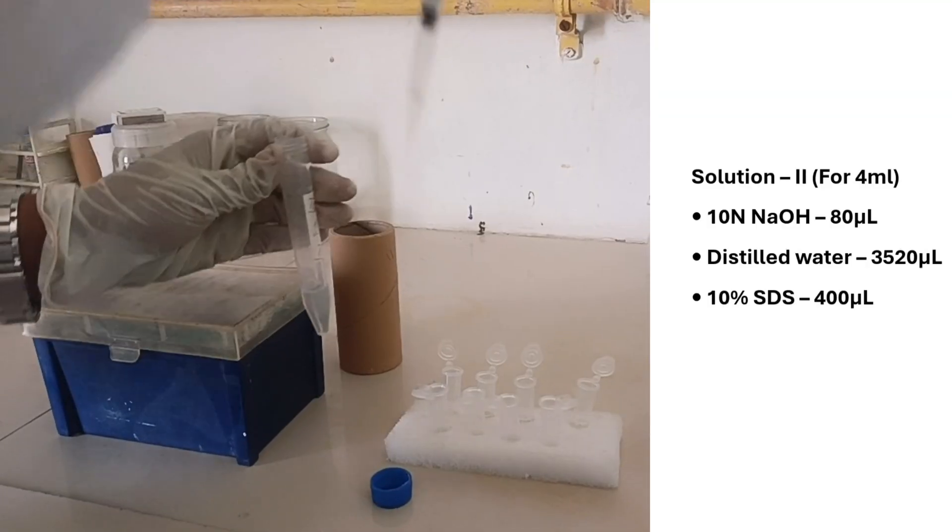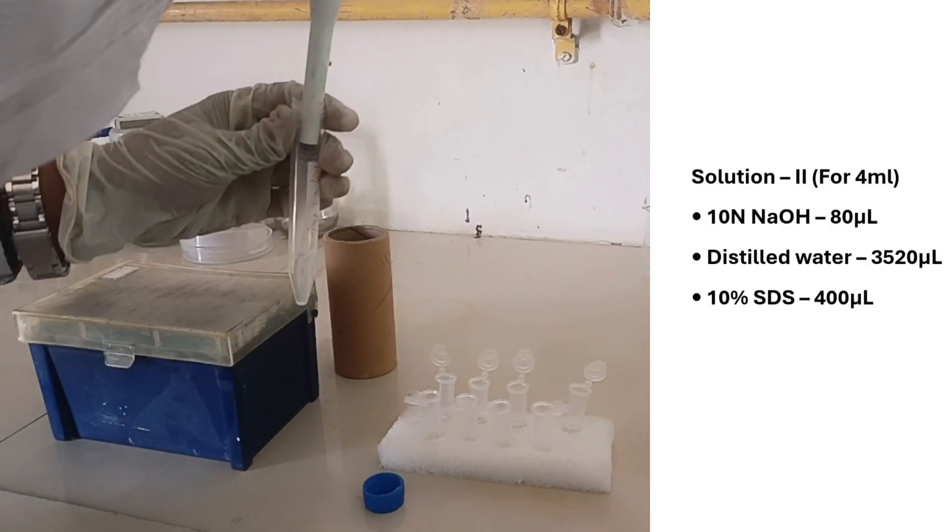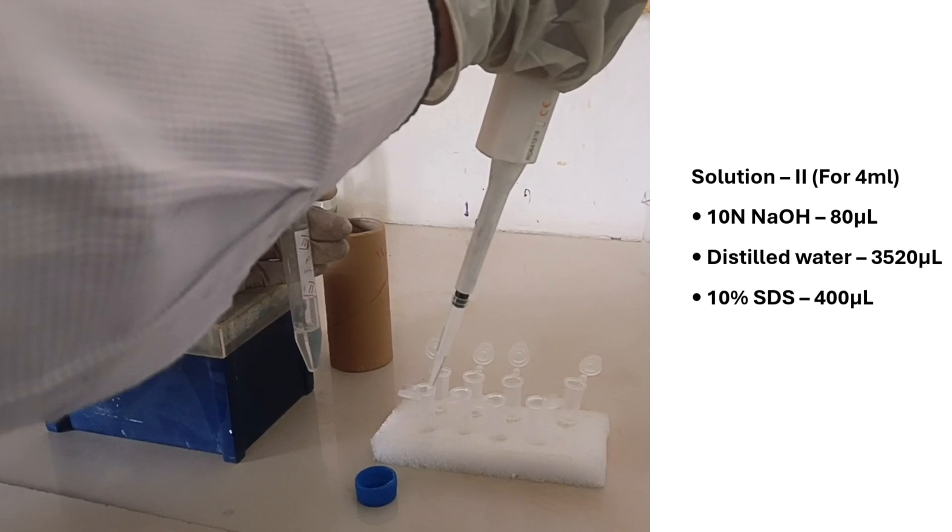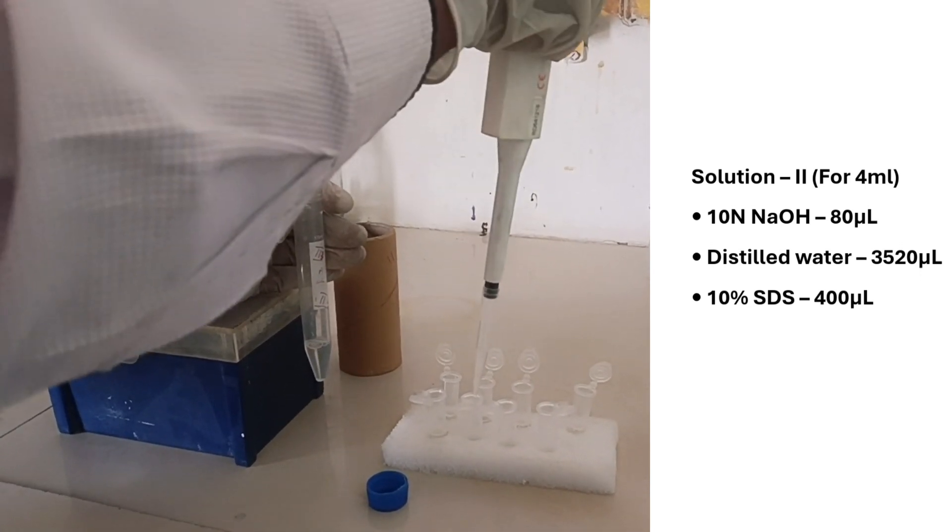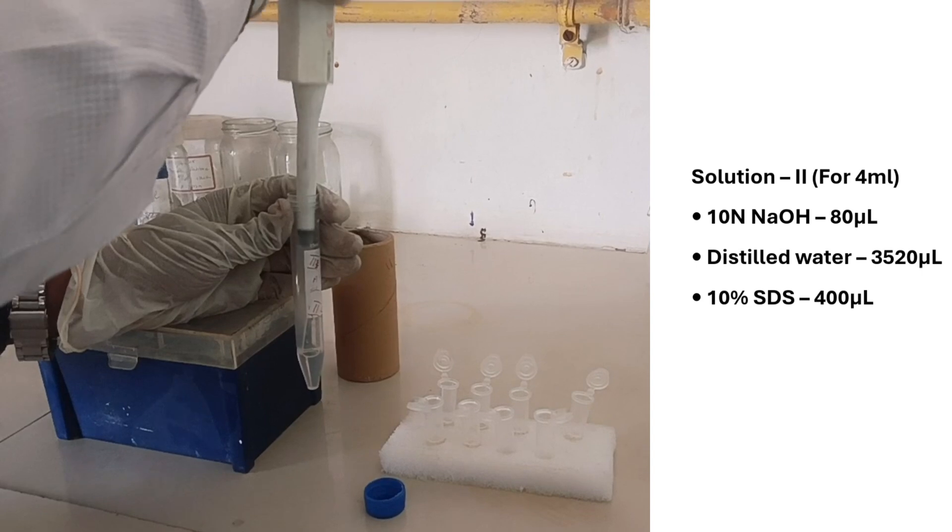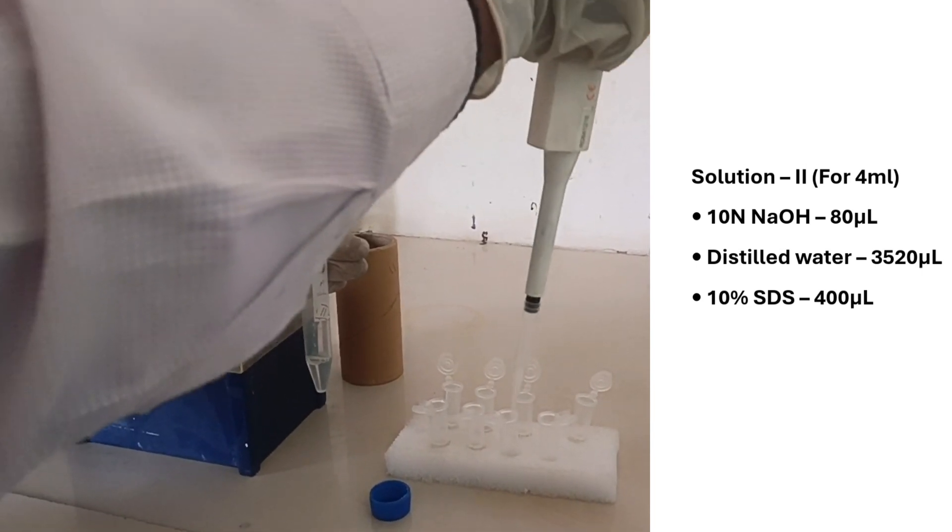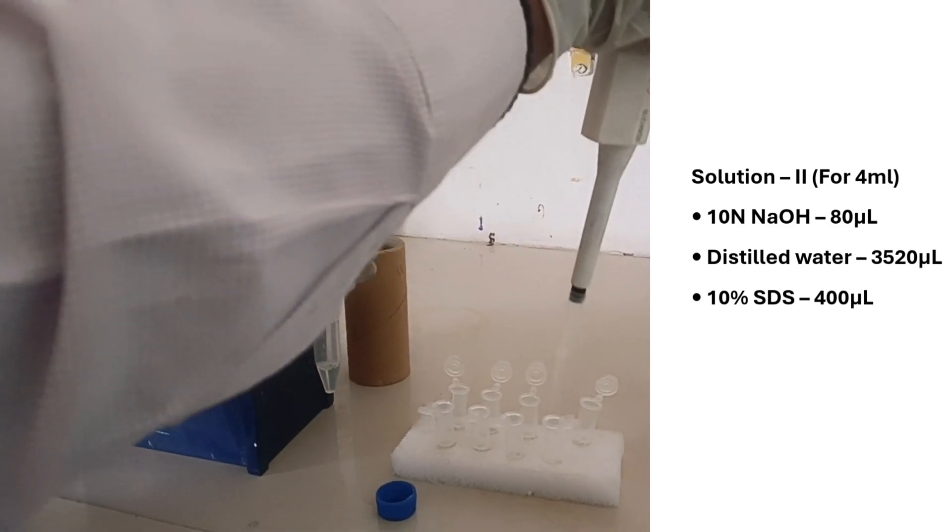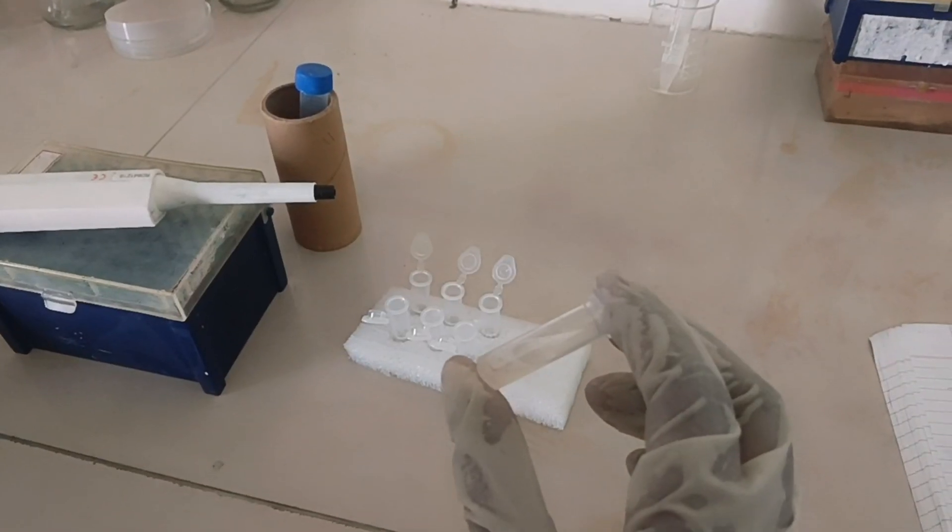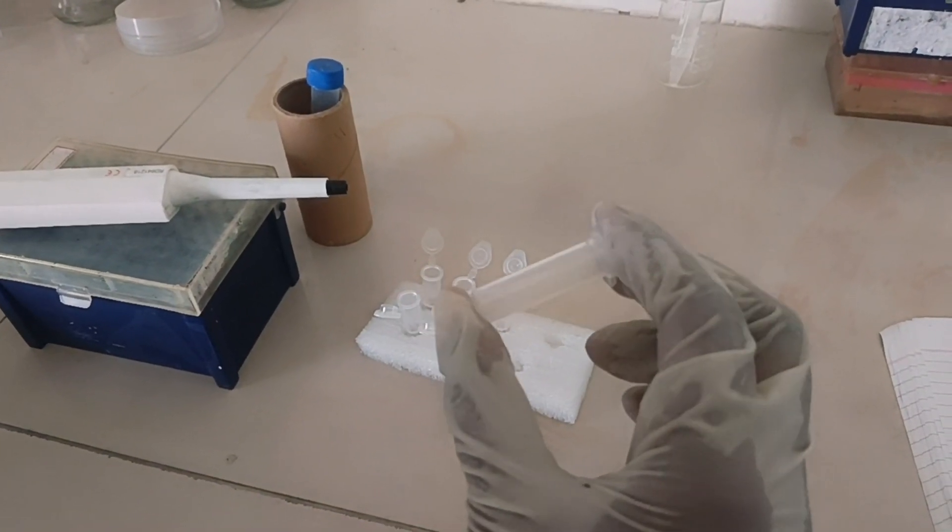We are going to add solution 2, 400 microliters which has been prepared for 4 ml by adding 10N NaOH 80 microliters, 10% SDS 400 microliters, and 3520 microliters distilled water. Gently mix the tubes by inverting upside down.